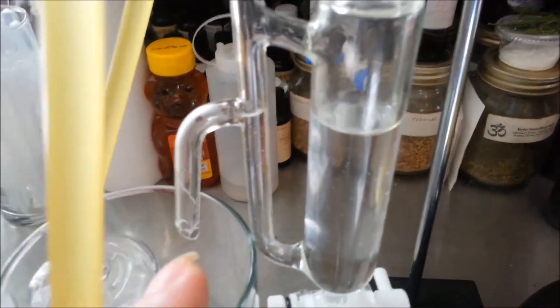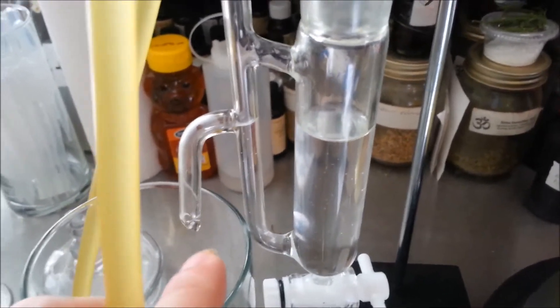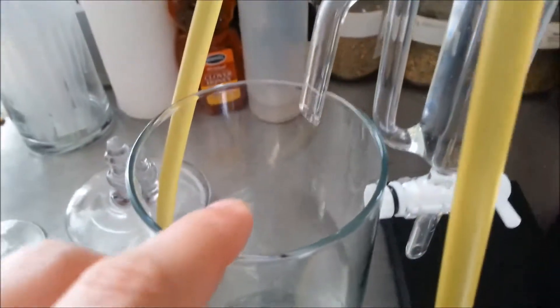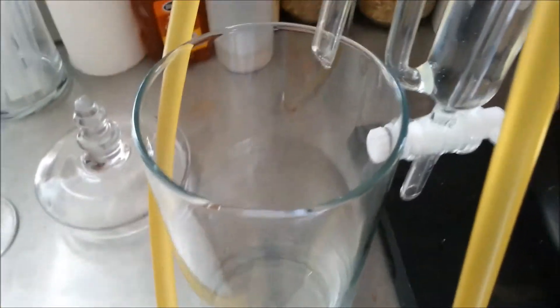What it does is drop out your hydrosol — or, in layman's terms, the scented water — from the side here, maintaining the oil on top so you don't lose any of your oil. You can just put something underneath it to catch your hydrosol, which is good for soap making and other things.